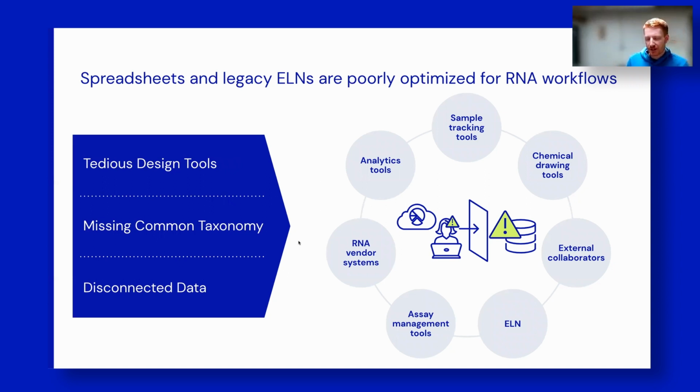Secondly, there's no common taxonomy or syntax for these RNAs. Each vendor, from IDT to Eurofins to Thermo, whoever, maybe even internal systems, all have a different way to translate an RNA sequence into a single sequence, representing all the chemical modifications. This makes it very challenging to share sequences with one another across teams, or even externally with collaborators.